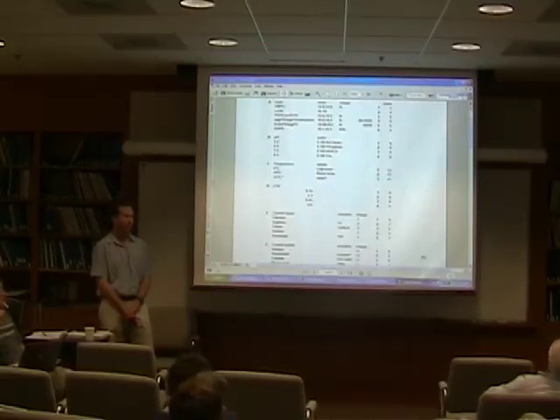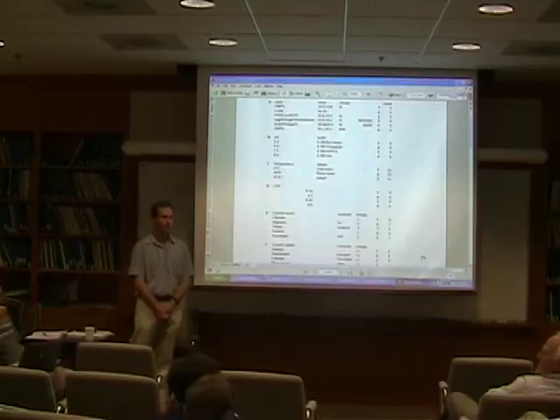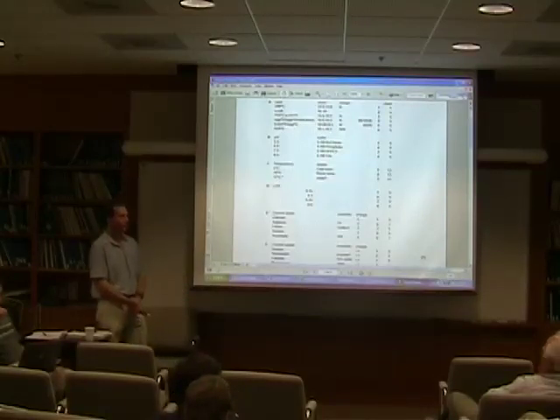So, looking at it and deciding in which direction you have to go by just understanding what happens, you can't. Yeah? But sometimes your crystallization trials look like crispy cornflakes, and sometimes they look like a water bag that just fell down, a balloon or so. And a crispy flake, I would think, needs more lipids, and a fluffy balloon needs less lipids or more magnesium or so. I think we don't know enough of what happens to understand that.